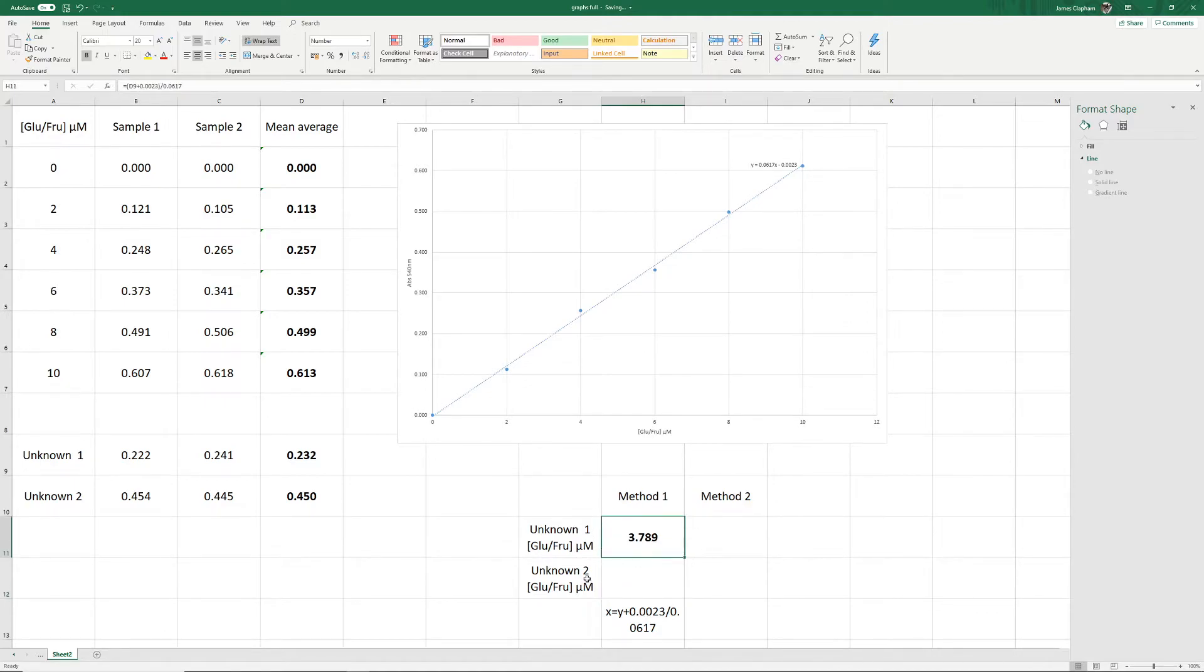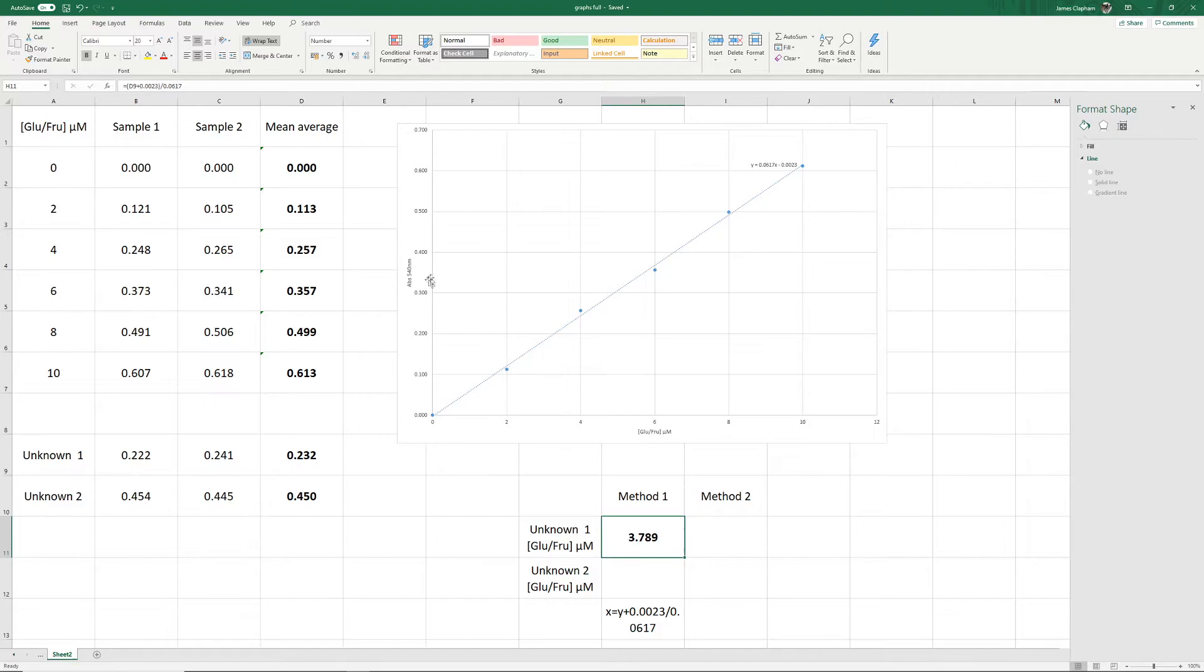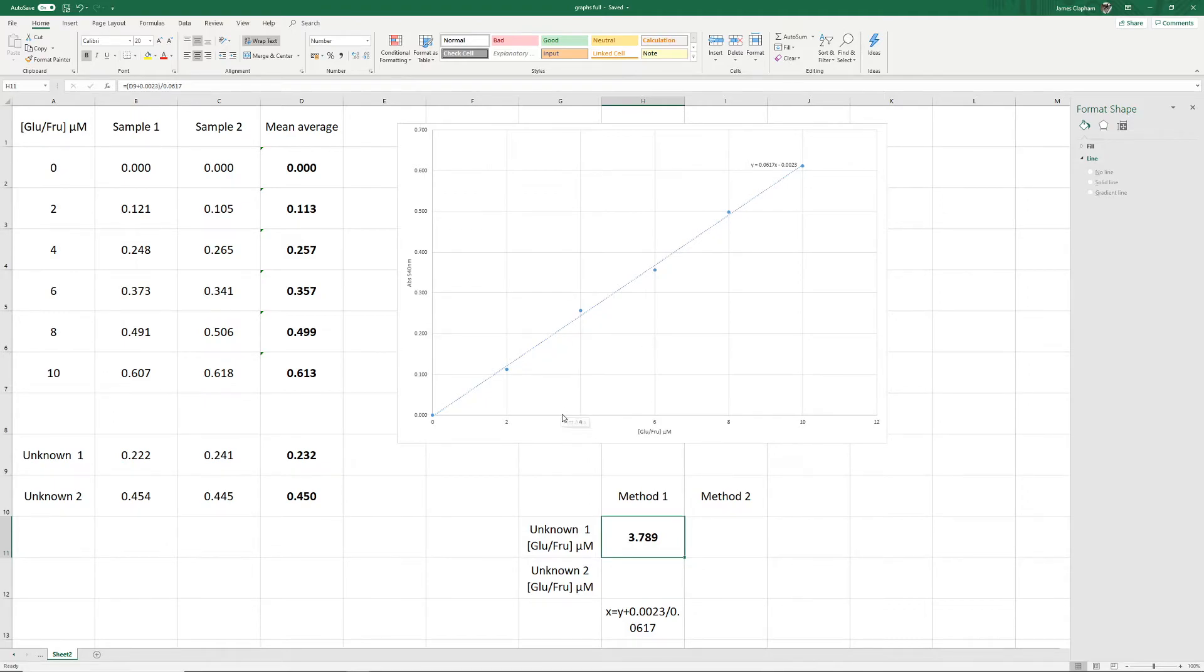It's always worth, whenever you do any calculations like this, just to double-check that the value it's giving you makes sense. Let's do our manual method again. So 0.232, go up to there, along to our line, and down. Yeah, that looks like it would be about 3.789.